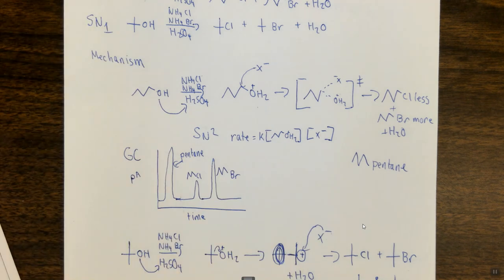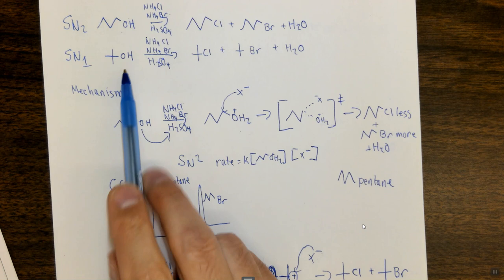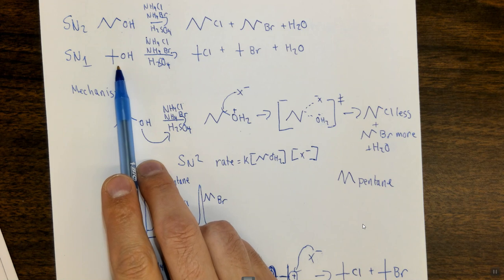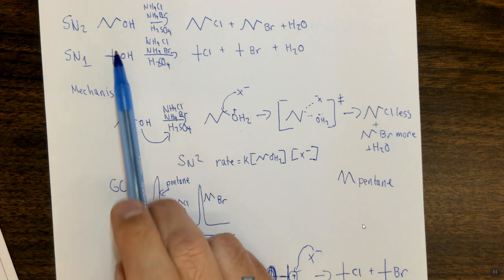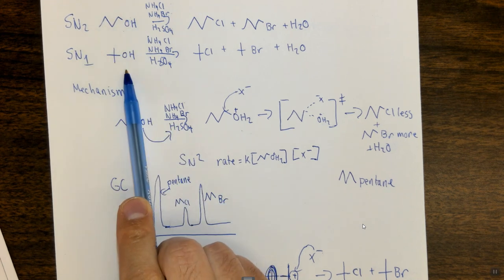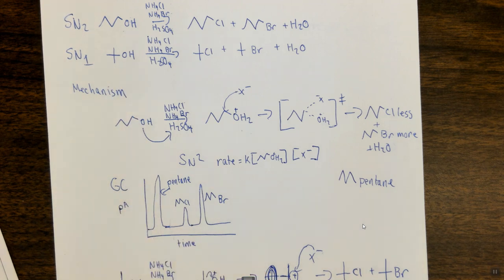It's very important that you do not heat this up. It doesn't have a condenser. It doesn't have a gas trap apparatus, so you're just going to do this at room temperature and stir it for 5 or 10 minutes and it'll go. This reaction goes easier than the other reaction, so this one requires heat, this one doesn't. It's very important you do not heat up that closed flask because that's extremely dangerous.